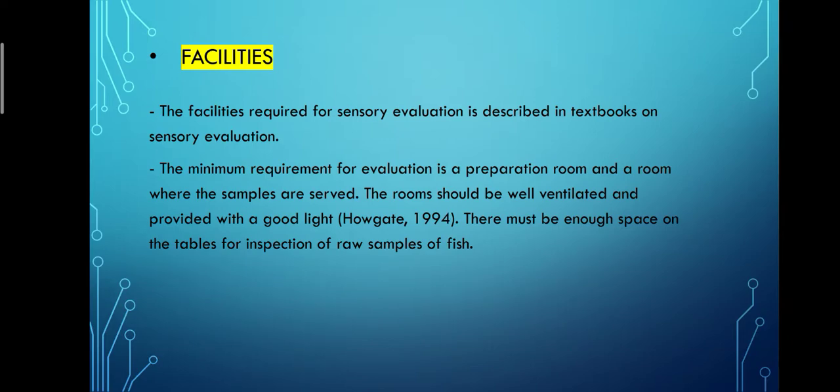Next, we have the facilities. The minimum requirement for evaluation is a preparation room and a room where the samples are served. The rooms should be well ventilated and provided with good light. There must be enough space on the tables for inspection of raw samples of fish.